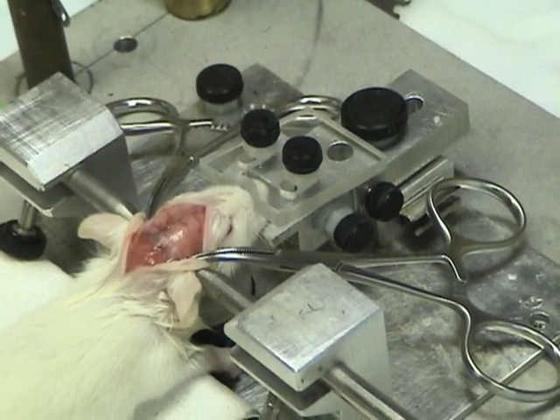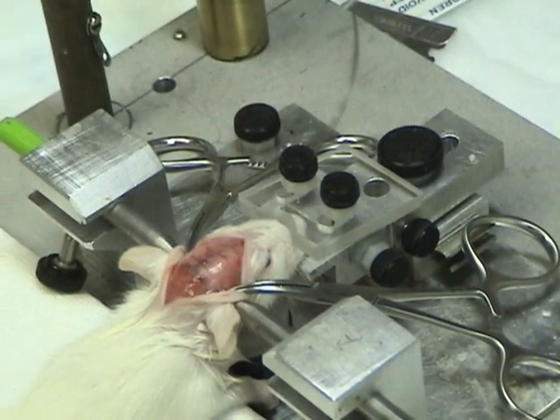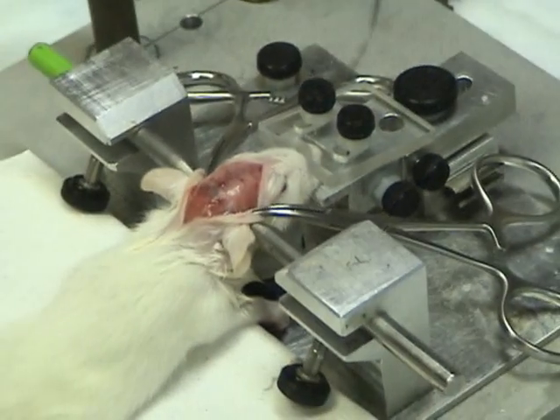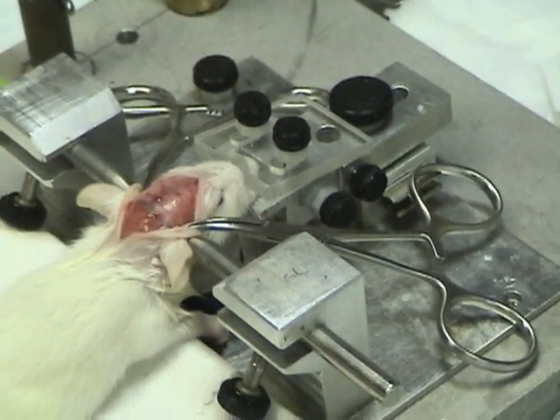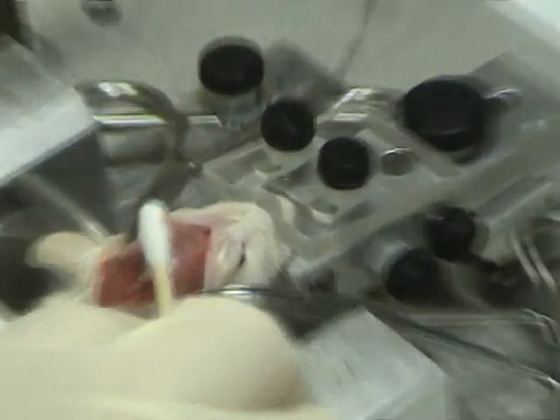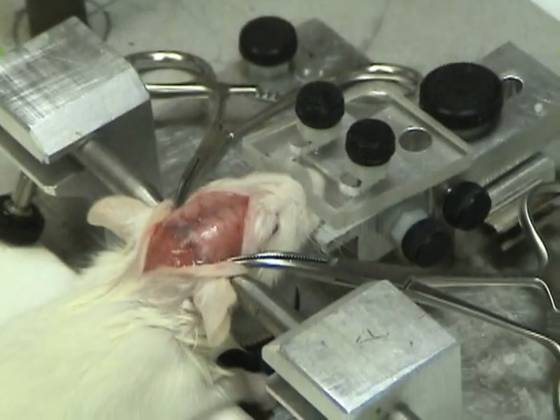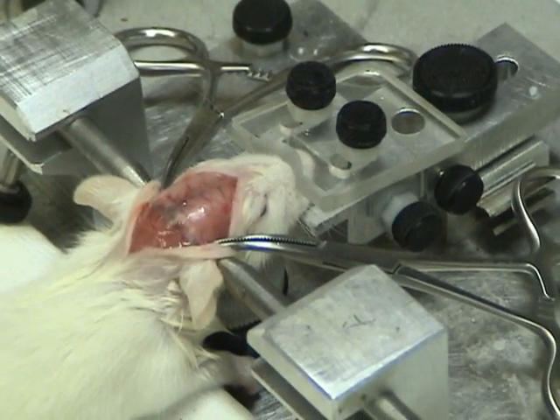Any problem with infection? No. You have to change the cage every day for the first week because dirty things can cause infection. A clean cage is important. During the first week, change the cage every day, and then it heals up. Minimum recovery time is one week.